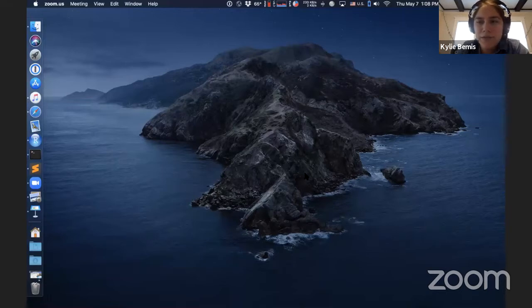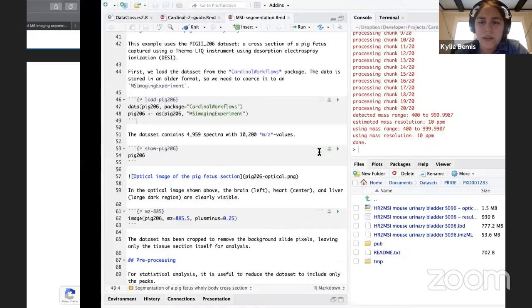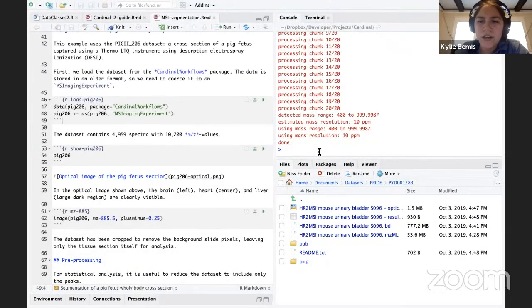There's really no way of knowing that without looking at the IMZML file itself. You can check to see what the mass to charge ratios actually are. But whether they got that way from some kind of pre-processing, peak picking, and alignment, or whether they got that way just from how they were recorded off the instrument, that information you would have to look for. You would have to check if the IMZML file contains that information.